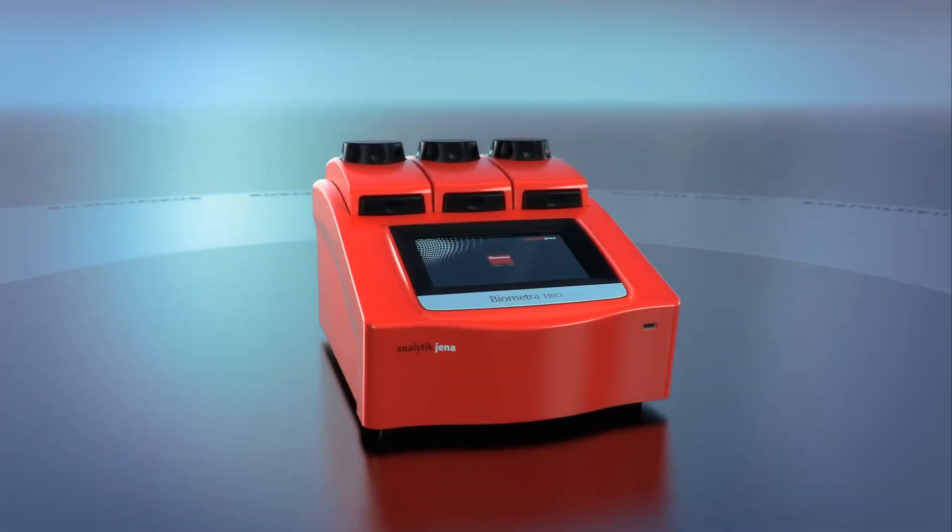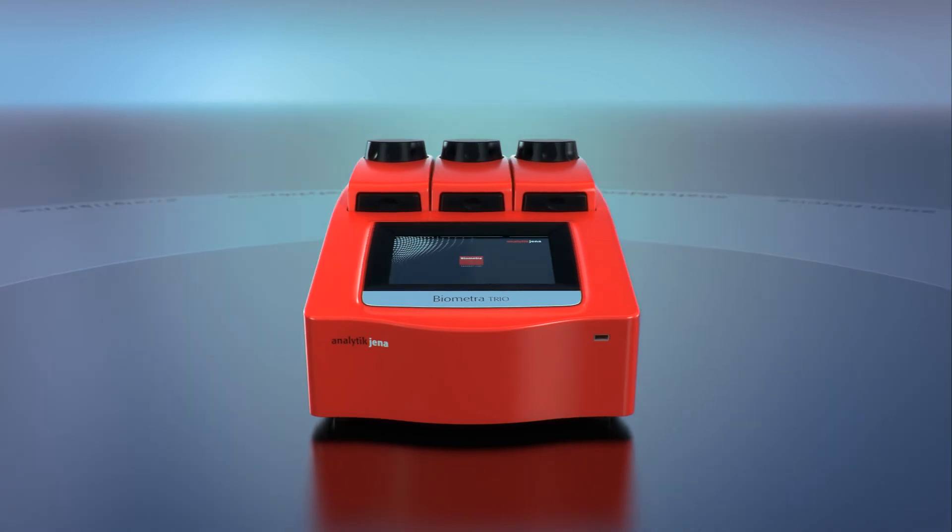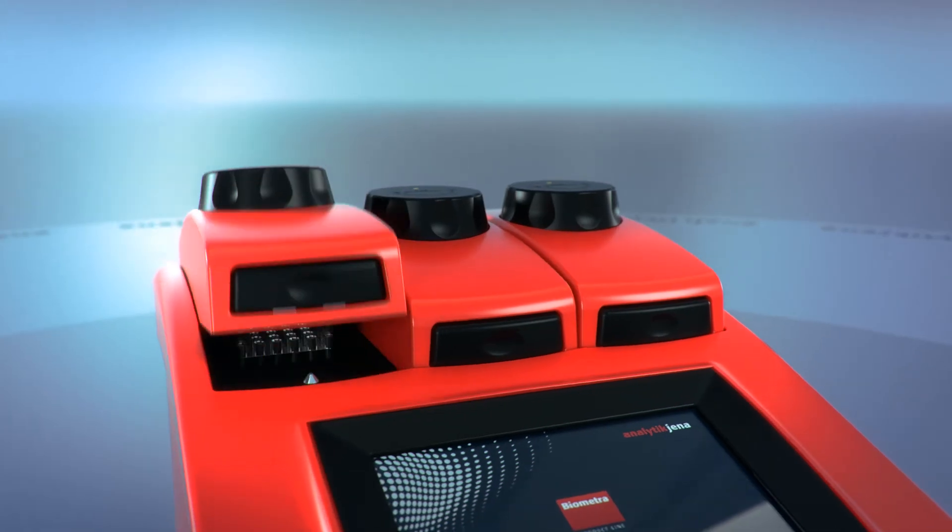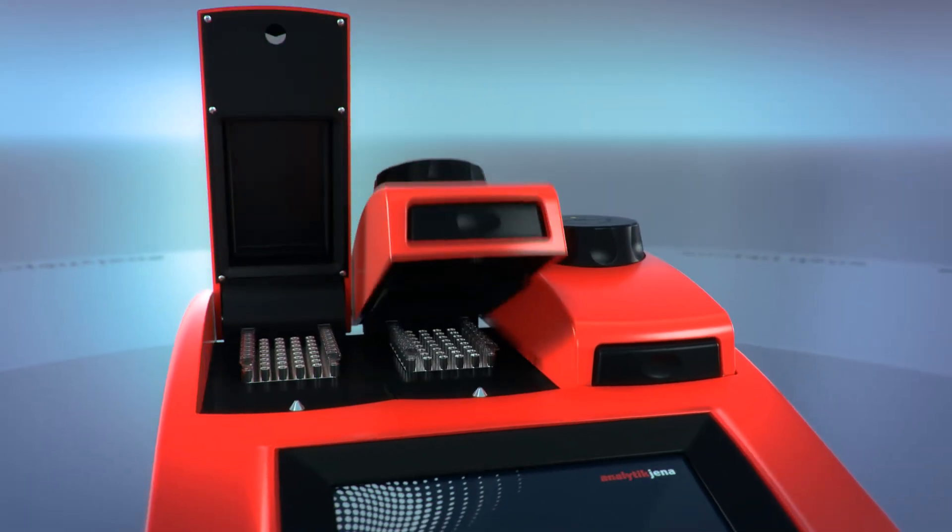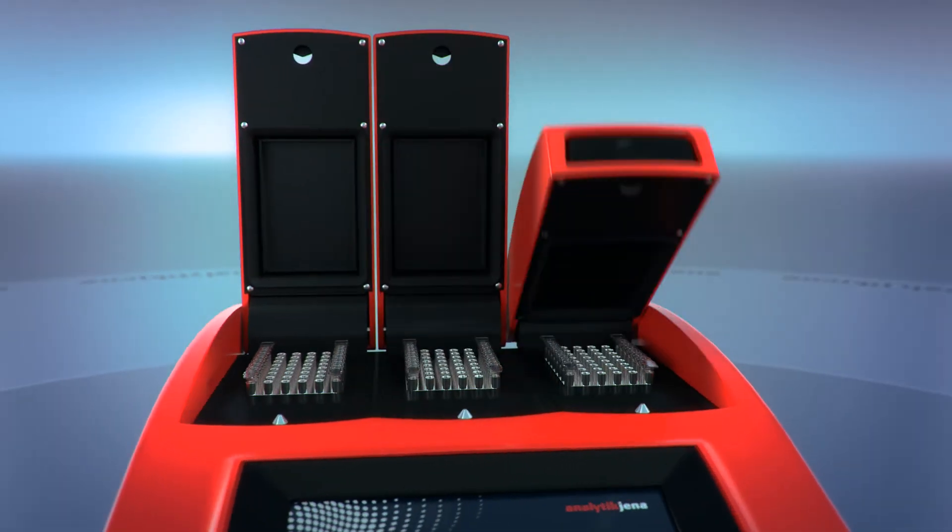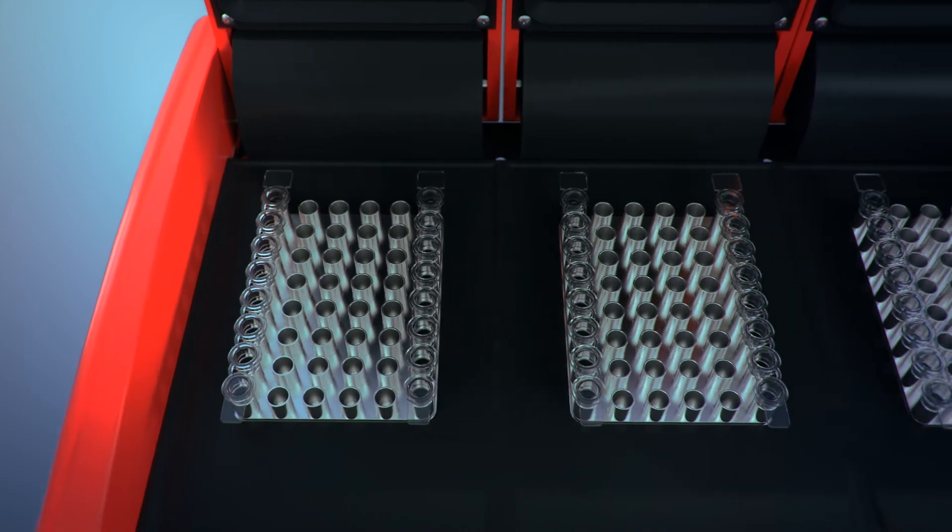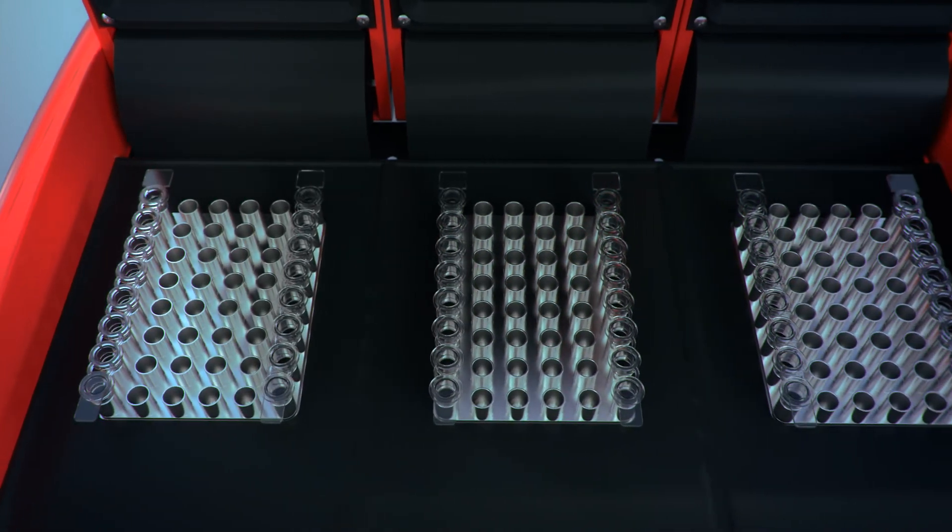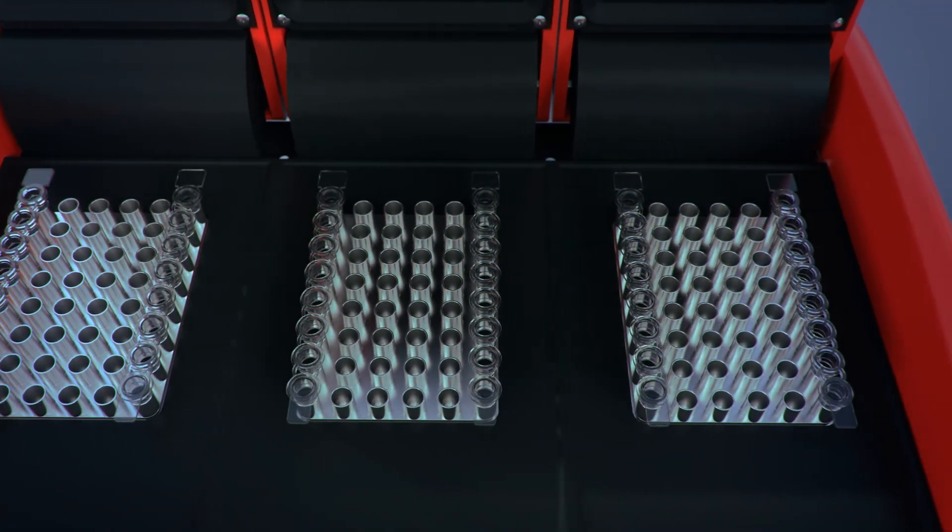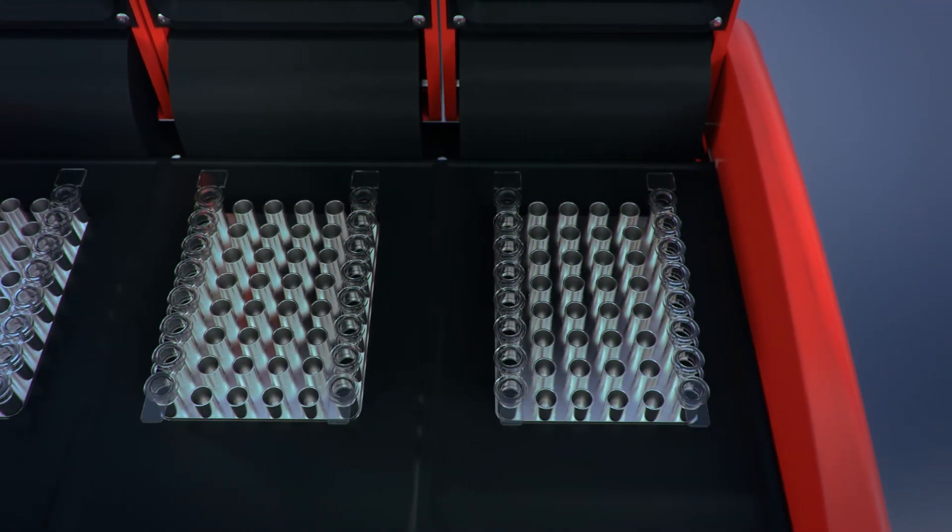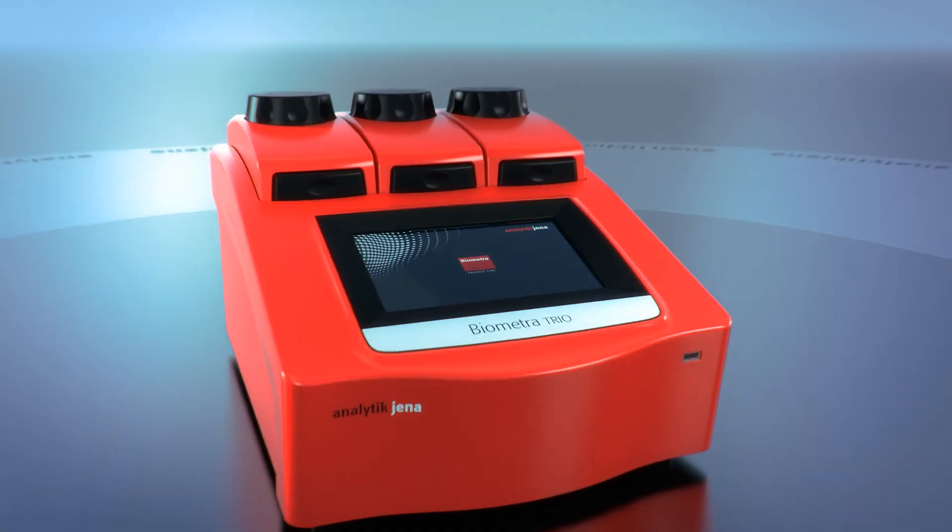Triple powered PCR. The Biometra Trio is a very flexible thermal cycler offering three independent sample blocks and heated lids to run different PCR reactions in parallel.